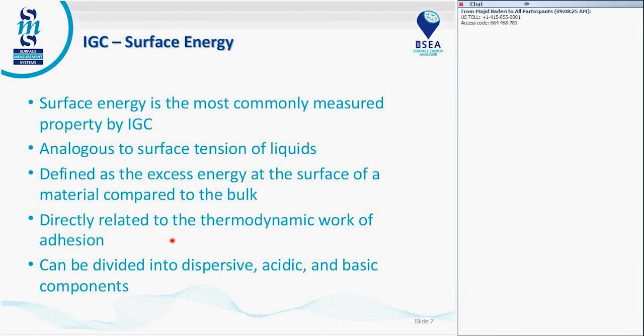So when interfacial adhesion or interfacial energy is important, the surface energy is extremely important and a strong contribution to adhesion-cohesion phenomena. The surface energy is typically divided into a dispersive and an acidic and basic, or some people call this polar, contribution.